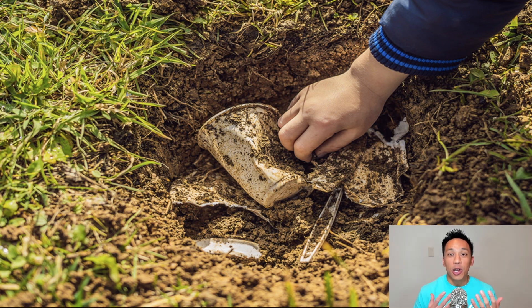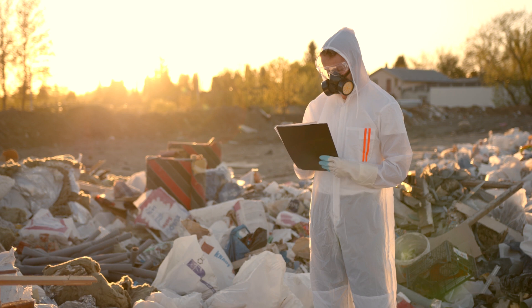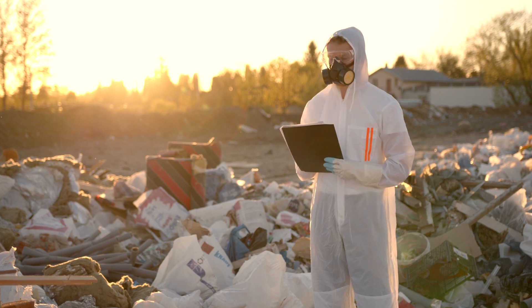How do we know that this actually works? And how do we know that you're not just being greenwashed? These disposable gloves actually go through a testing process known as ASTM.